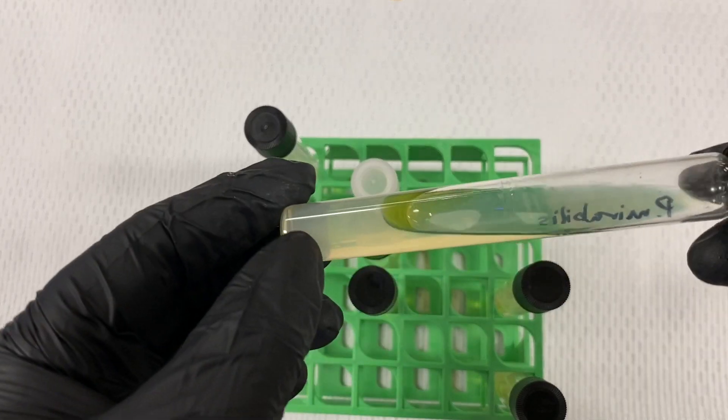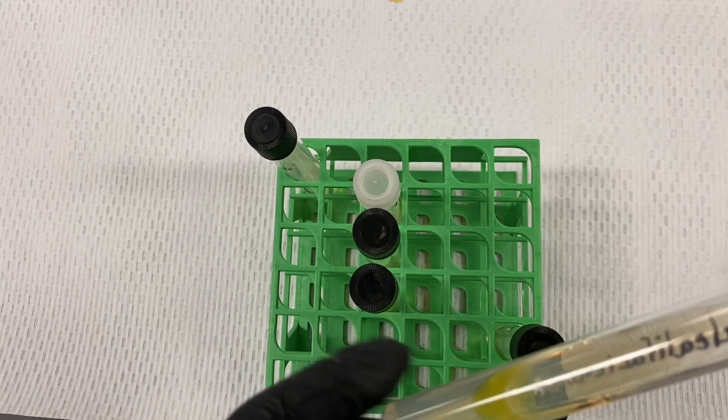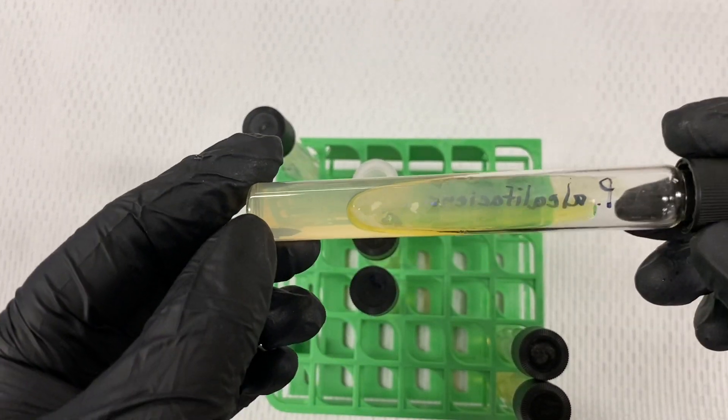Versus a clear-cut green color being produced, versus a negative type of result. Just to compare side by side.